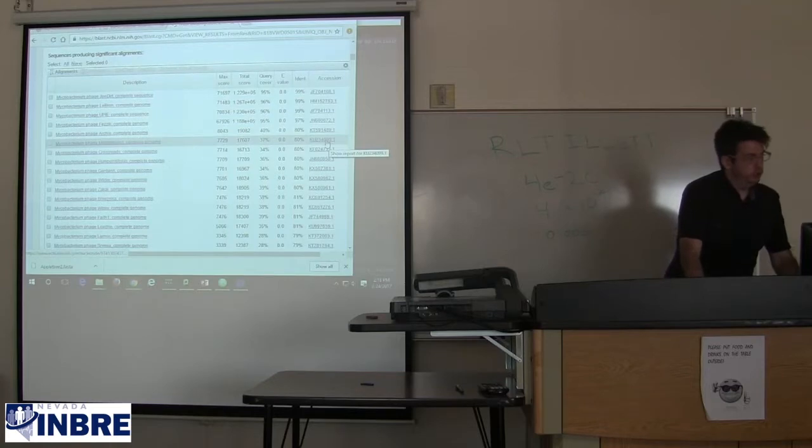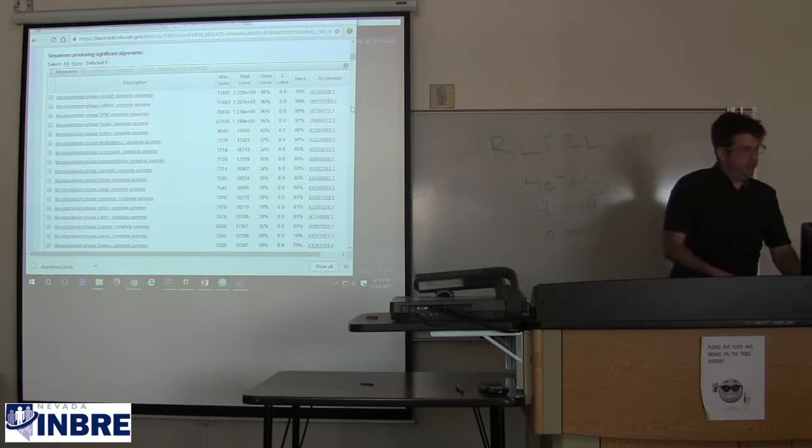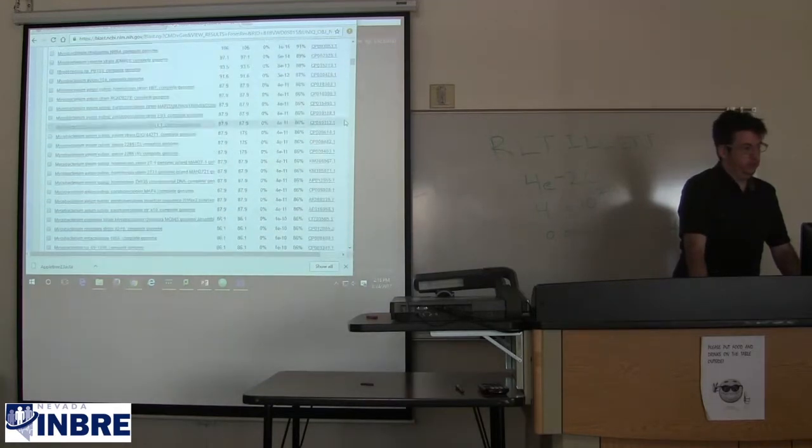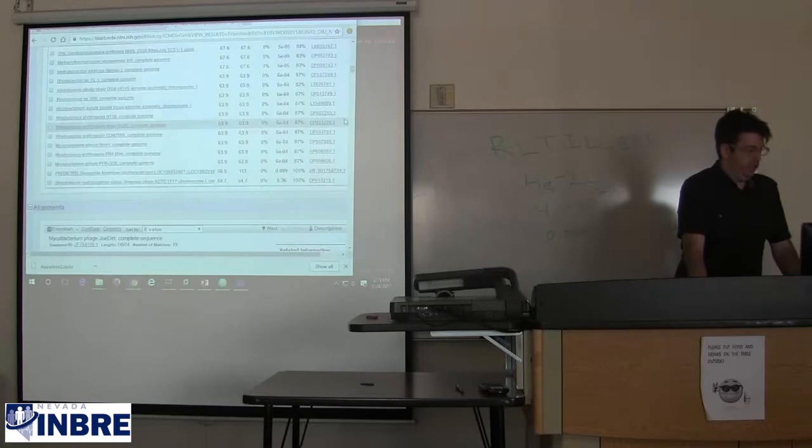We'll get to a hit table here that shows the ordering of these top 4 hits: Joe Dirt, LeBron, UPIE, and Fezzik. They are just heads and shoulders above all of the other complete genomes as far as NCBI knows. They also have extremely good e-values, and we get our top 100 hits.